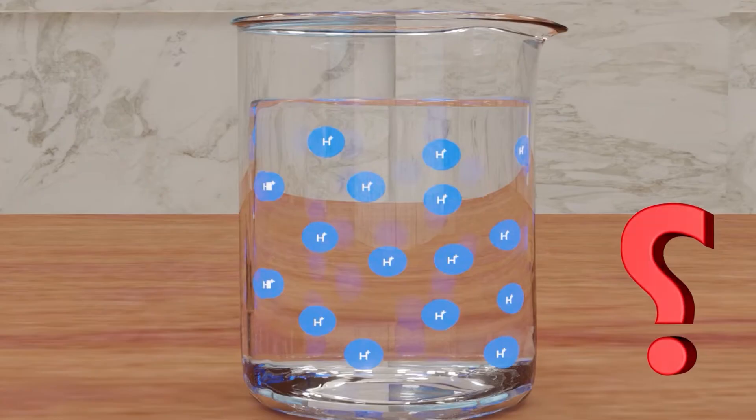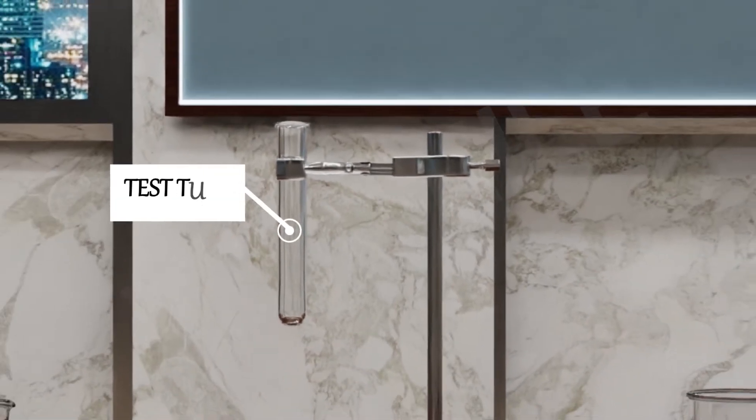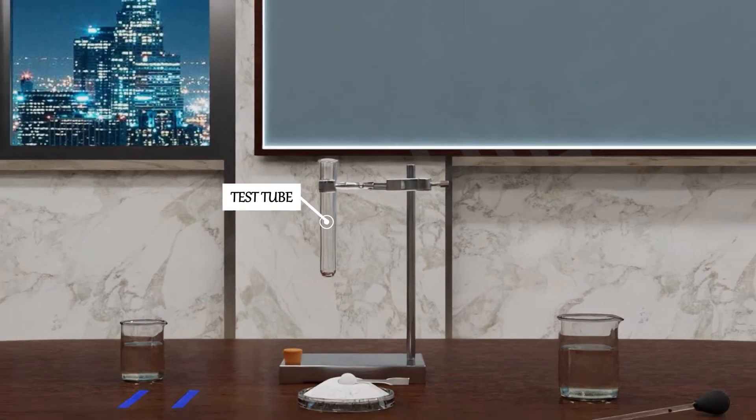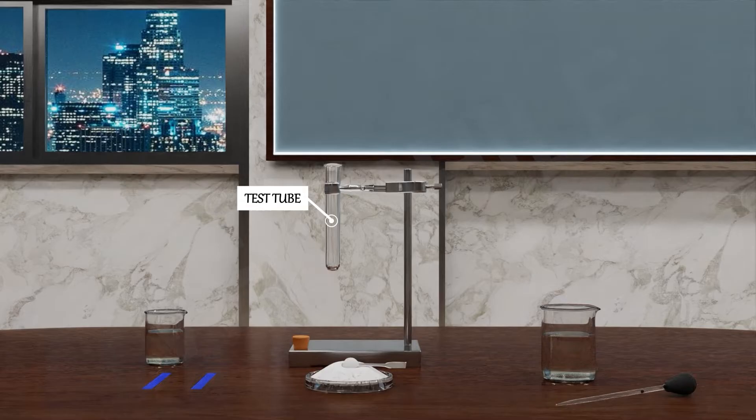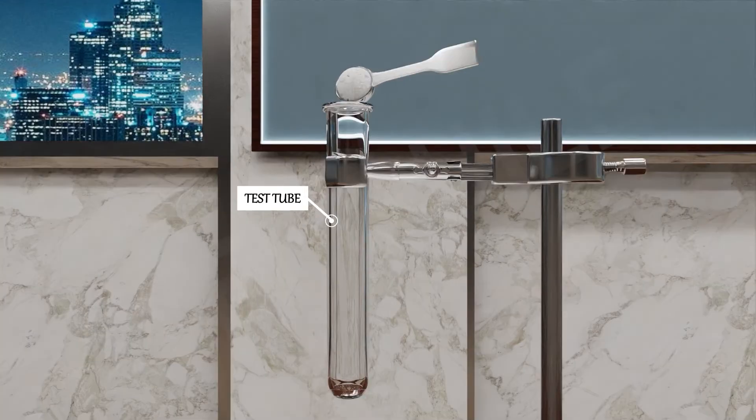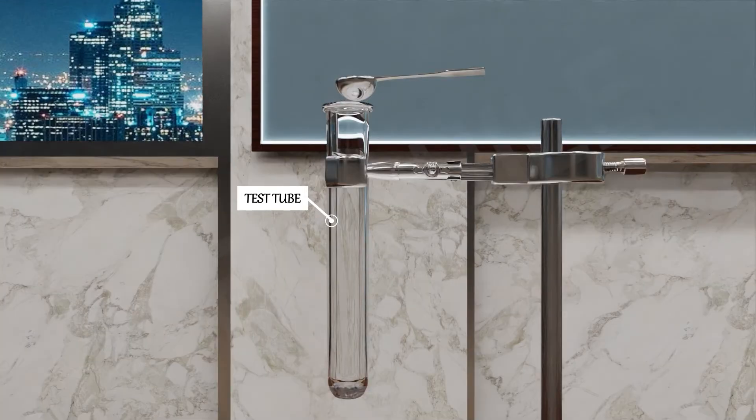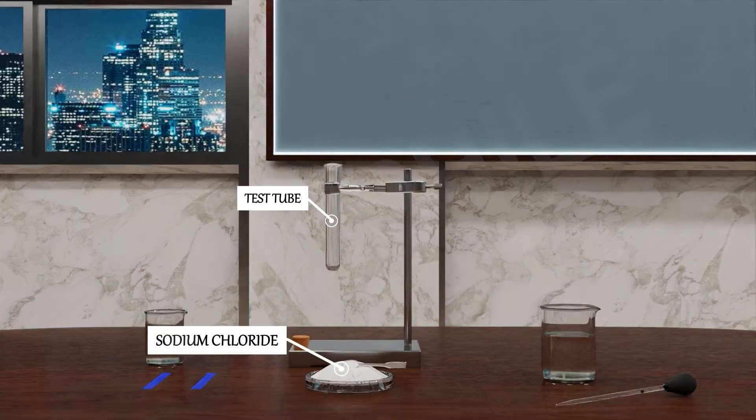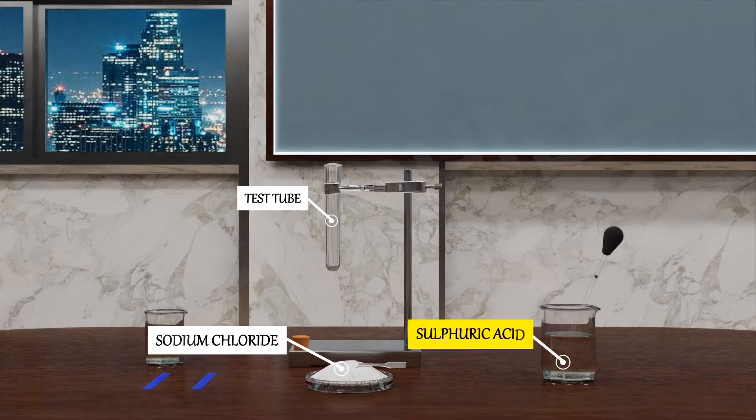So let's do an experiment. Can you see this test tube which is held by the pair of tongs? Take about 1 gram solid NaCl, meaning salt, in a clean and dry test tube.